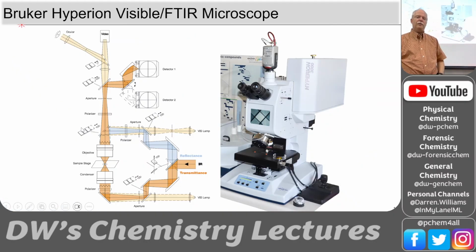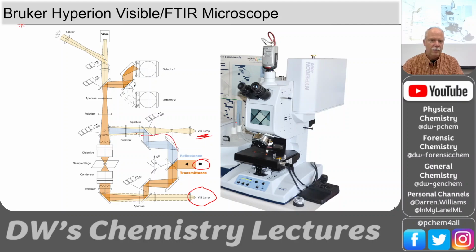And here's the microscope that we have, this infrared microscope. So this is pretty cool. It does visible and infrared microscopy. So it's got a visible lamp for reflectance, where it comes from the top and hits the sample. It's got a visible lamp for transmission, where it comes from the bottom. You can send the infrared beam up to the top and do infrared from the top. You can send the infrared beam down to the bottom and go through the sample. And then it comes up here and it splits over to the detector.